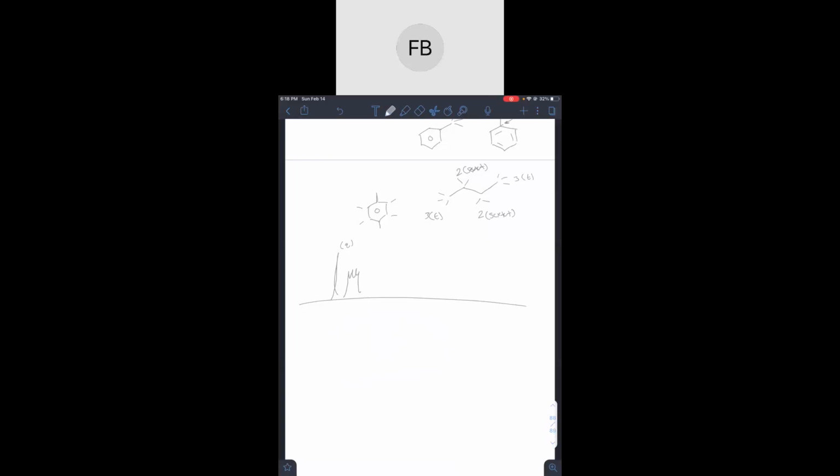So after that, you look all the way to the right, and there's a singlet here, and he says that this is a 6 singlet. 6 hydrogen singlet. So we know that there are 6 hydrogens that have adjacent 0 hydrogens. So that tells us these are each methyls. Does that make sense? Because there's 6 hydrogens, right? 1, 2, 3, 1, 2, 3. There's 6 hydrogens that each of them is basically in the same position on this molecule.